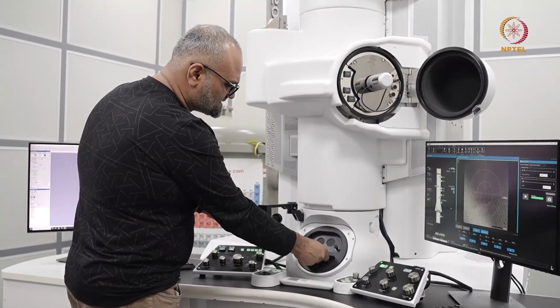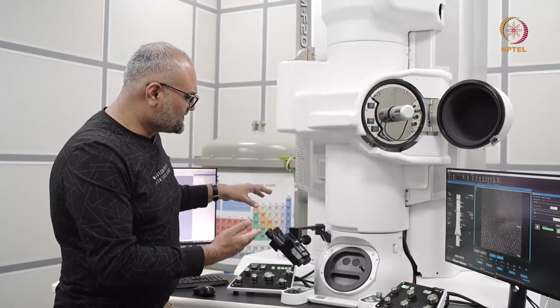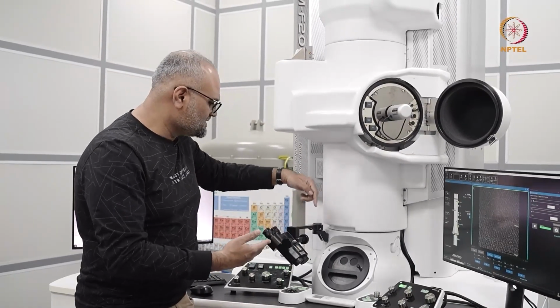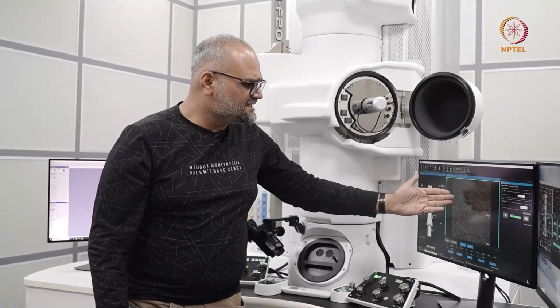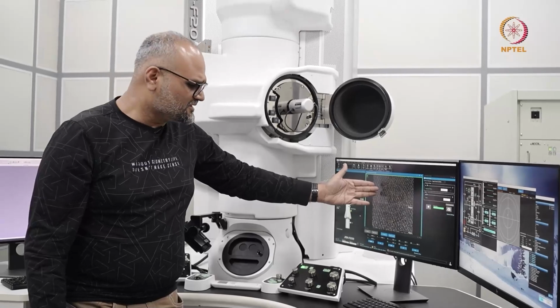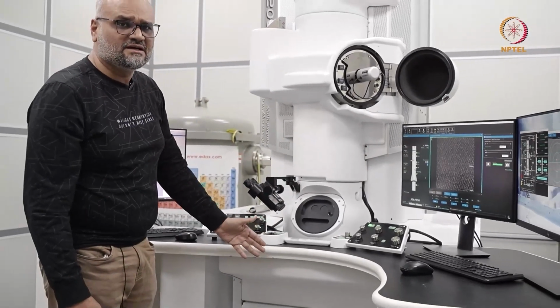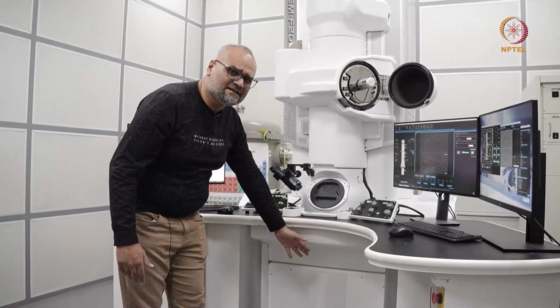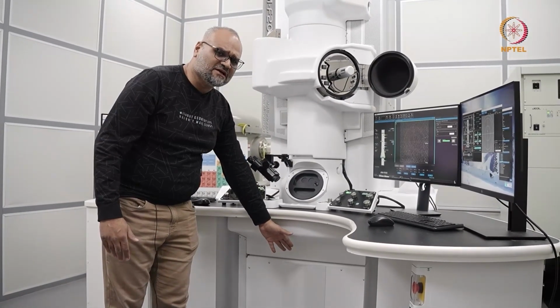Now, this instrument also has a fluorescent screen camera. So you have a camera which is pointing towards the fluorescent screen here, and you can record and see the live images on the fluorescent screen on the microscope computer. If I go down, going back to the layout that we saw, whatever is concealed here also contains a CMOS camera in this particular microscope.